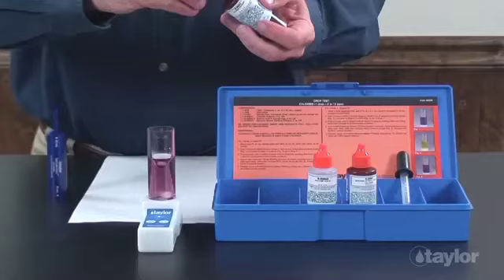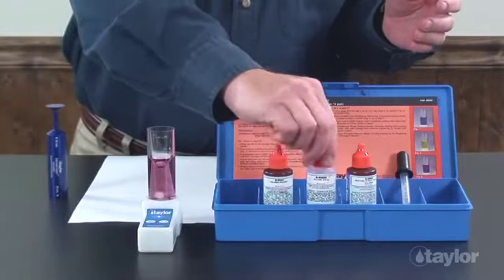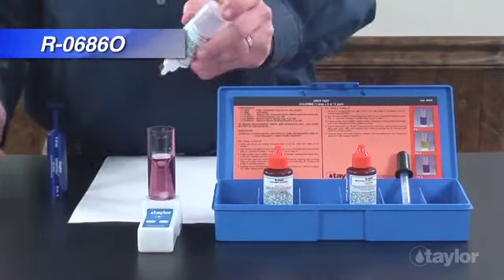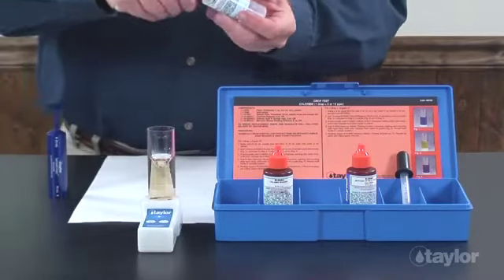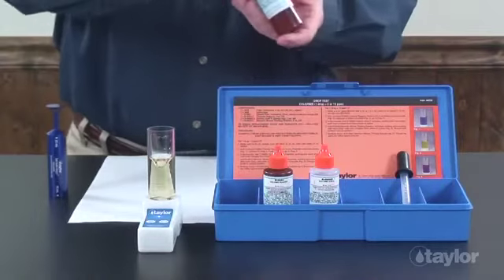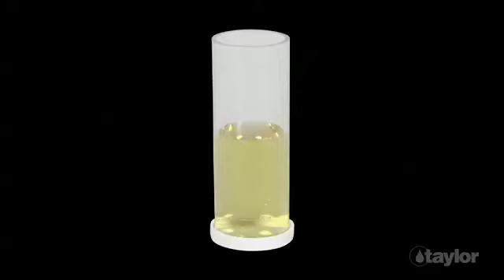If the sample turns blue-purple, this is an indication that the pH is too high. To bring the pH into the proper range for testing, add reagent 686O, sulfuric acid 1 normal, dropwise, swirling after each drop until the color changes from blue-purple to yellow. Note, if the sample turns yellow after adding the chloride reagent, the pH is already in the correct range for testing. There is no need to add the sulfuric acid.